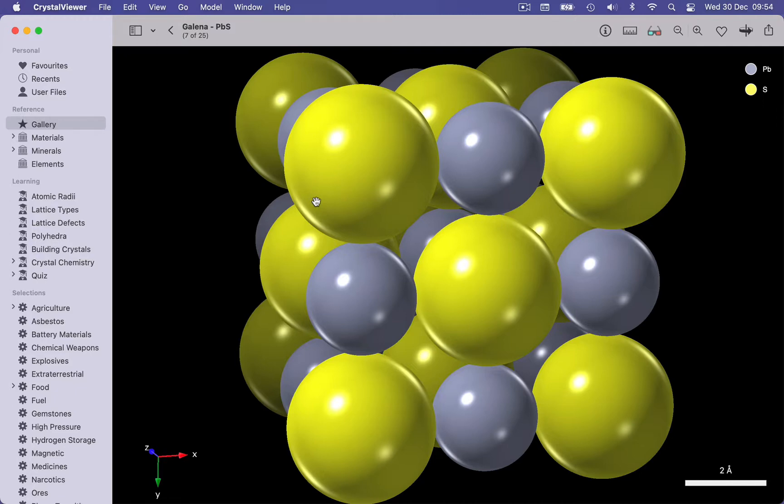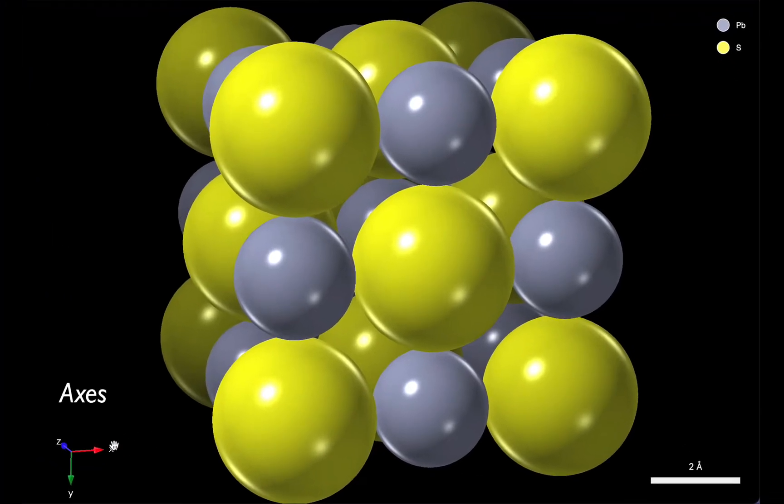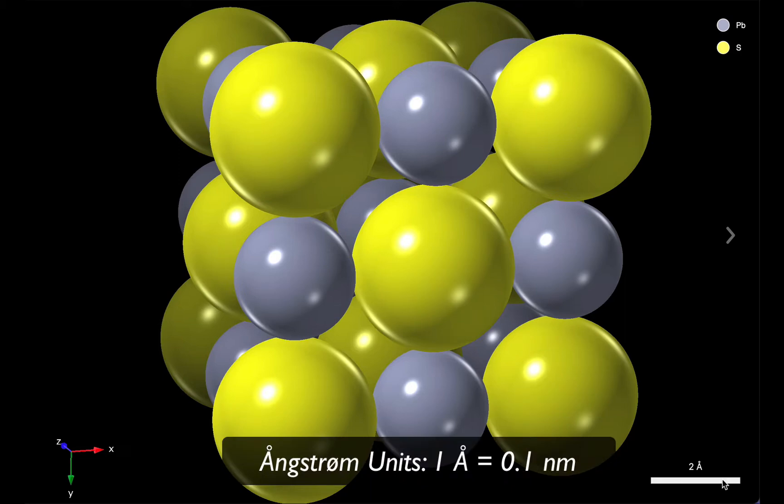Before we start to interact with the structure itself, let's look at the other items in the viewer. In the bottom left-hand corner, we have a set of axes, and these help us orient ourselves relative to the crystal structure. In the bottom right-hand corner, we have a scale bar, and this is marked in angstrom units, where one angstrom is 10 to the minus 10 metres, that's 0.1 nanometres. Angstroms are the standard units in crystallography because most atoms have radii close to one angstrom in size.